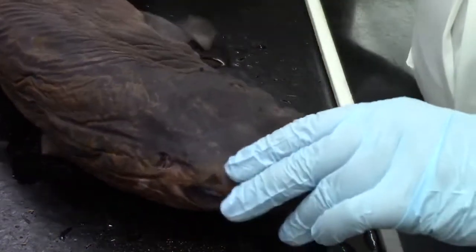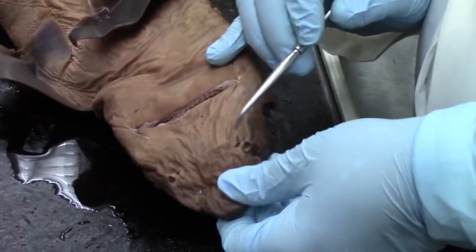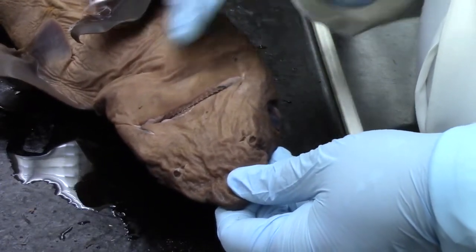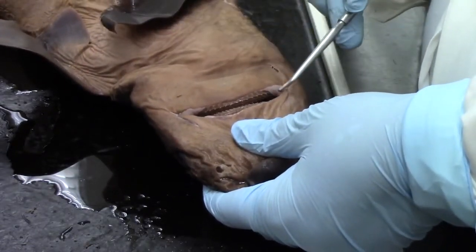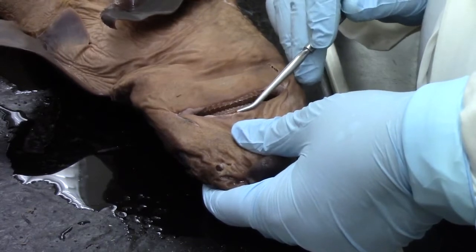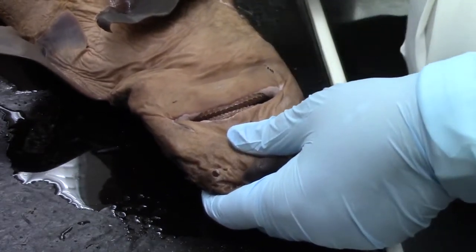If we turn the animal to the ventral side here, we can find the nares. So that's these ones here. And then of course we can see the mouth as well. What you may not be able to see, but you'll definitely be able to see when we do the dissection in person, is that there are many rows of teeth. So as soon as one tooth is lost, there are more rows of them ready to take its place.